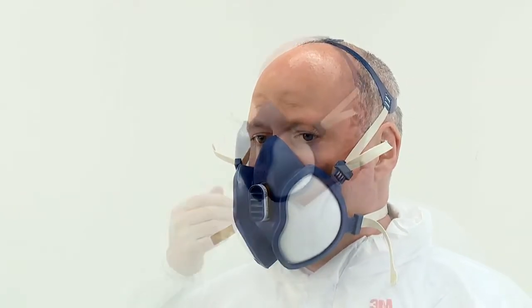The seal of the respirator on the face should be fit checked before entering the workplace. A fit check is performed by placing the palm of your hand over the exhalation valve cover, followed by exhaling gently. You should feel the face piece bulge slightly.